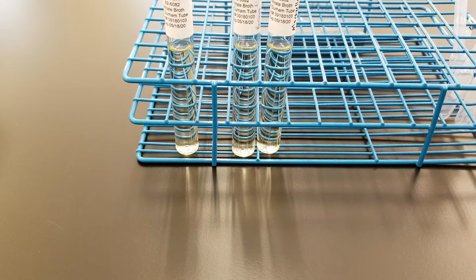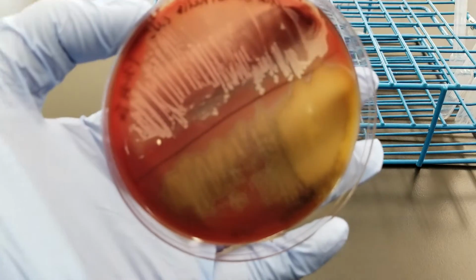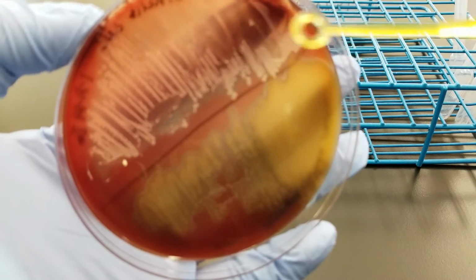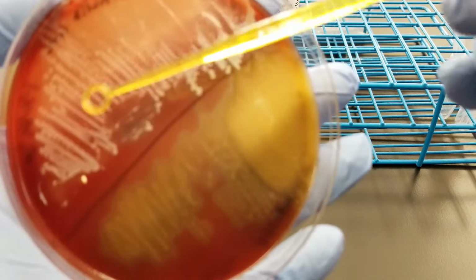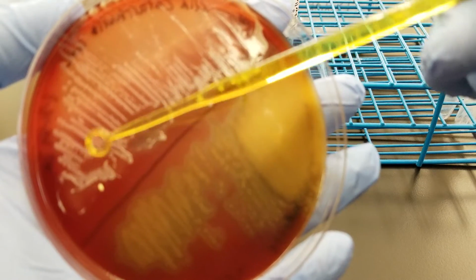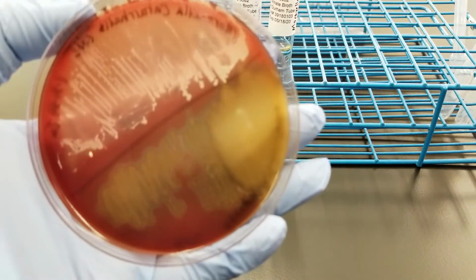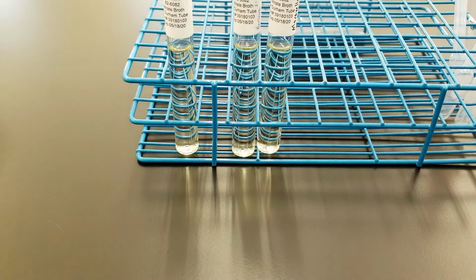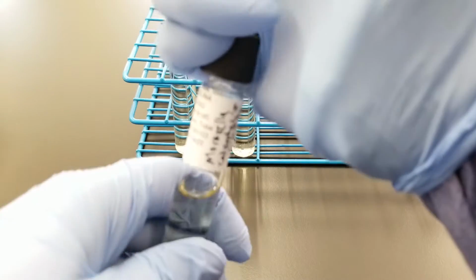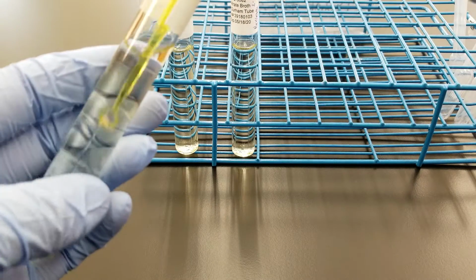We're going to go ahead and do Moraxella. So this is a stock culture. Notice I've been using it for a lot of stuff. That's why there's a lot of it missing. So we're going to take a loop full of this. I don't know why it's not focusing. Sorry about that. There we go. A loop full of this, okay? And we're going to inoculate it into the Moraxella tube.